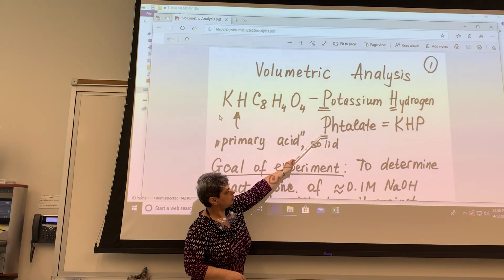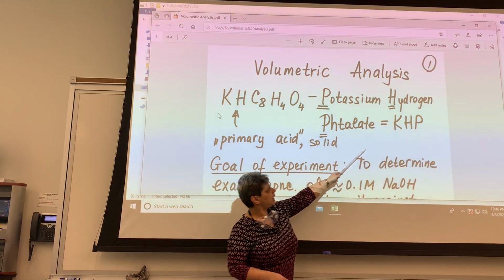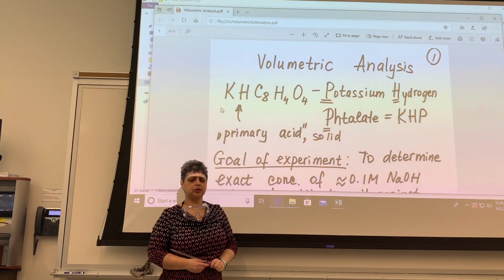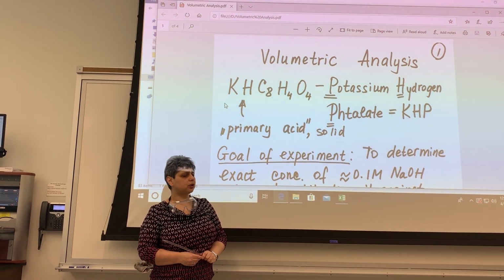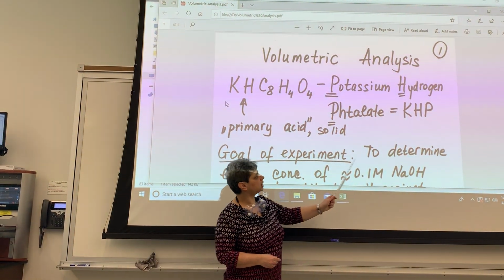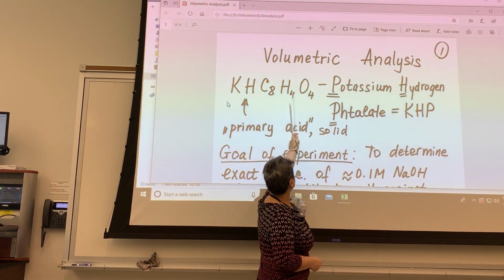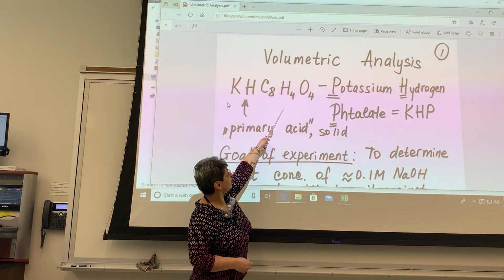Here is the name. It's abbreviated as KHP. So when you watch other videos that I posted on Canvas, it will talk about KHP. It does not mean a chemical formula, rather it's an abbreviation of a name. The chemical formula of KHP is shown right here.